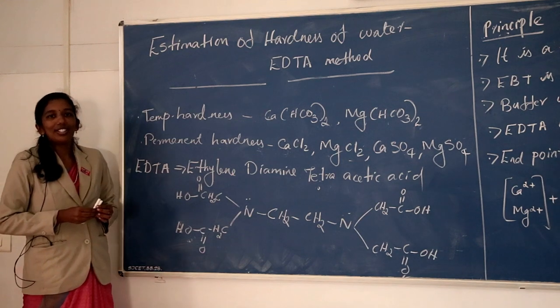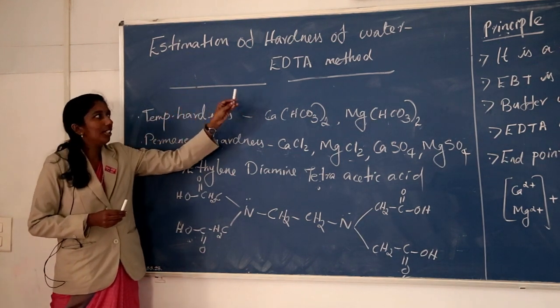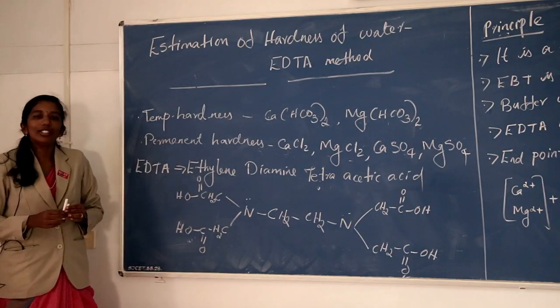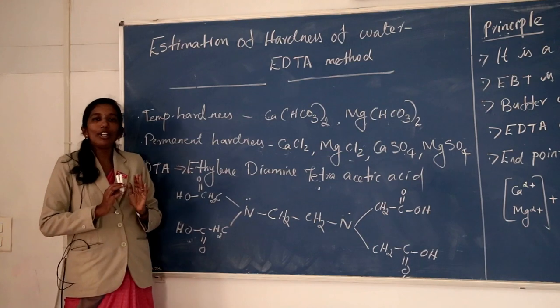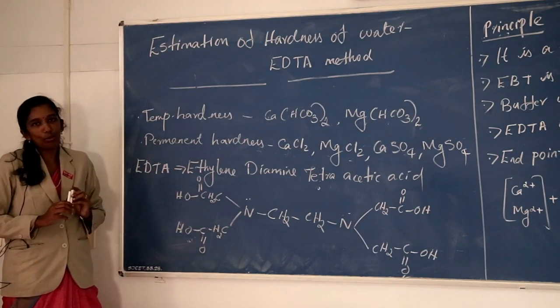Good morning, students. Today we discuss estimation of hardness of water by EDTA method. What is hardness of water? It is the property of water which does not produce lather with soap.